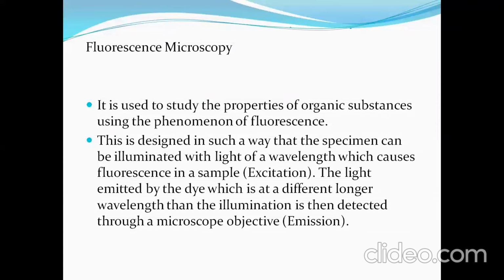This is designed in such a way that the specimen can be illuminated with light of a wavelength which causes fluorescence in a sample. The light emitted by the dye, which is at a different, longer wavelength than the illumination, is then detected through the microscope objective. In a simplified way, certain dyes, known as fluorescent dyes or fluorochromes, are normally used.